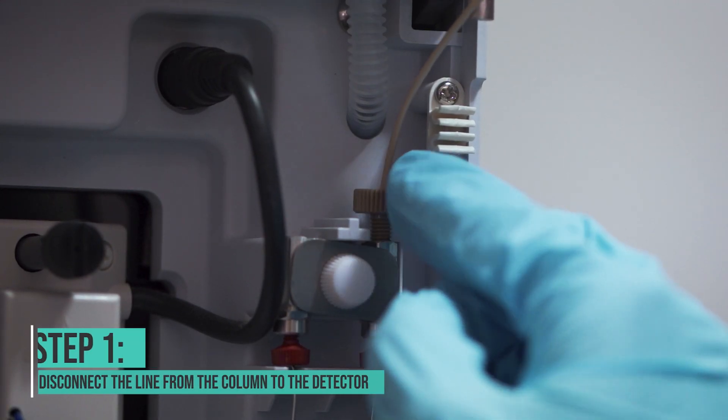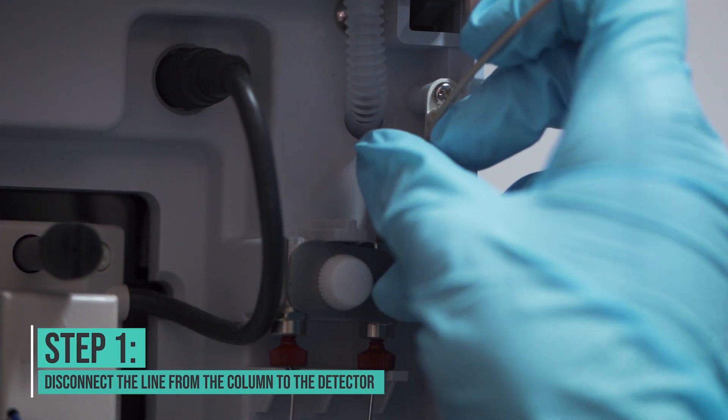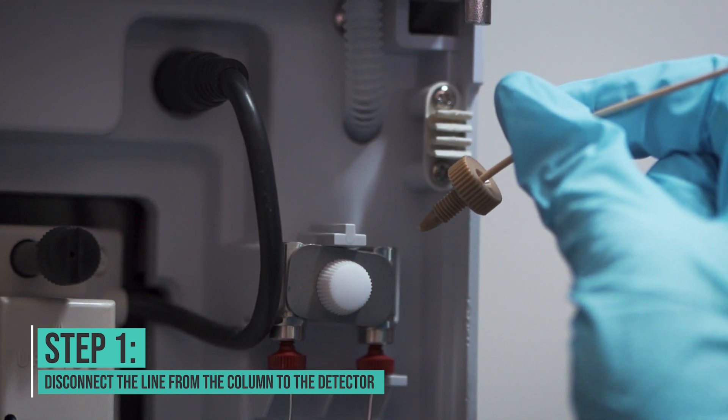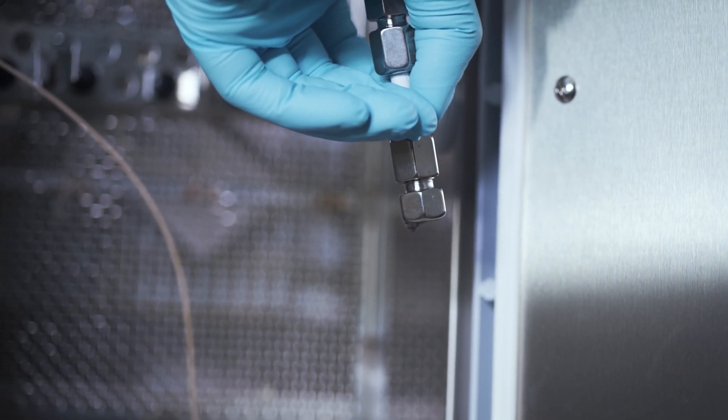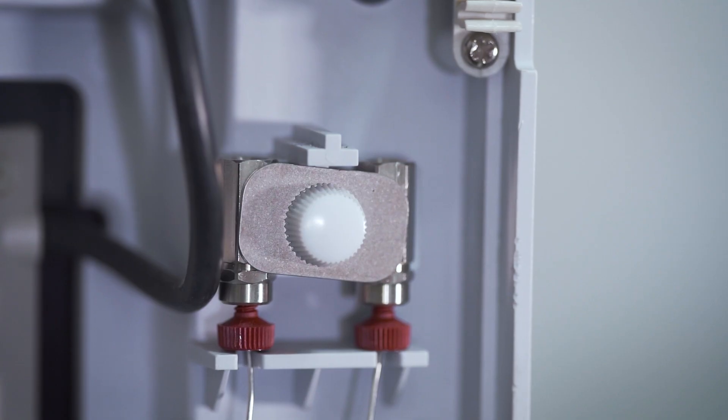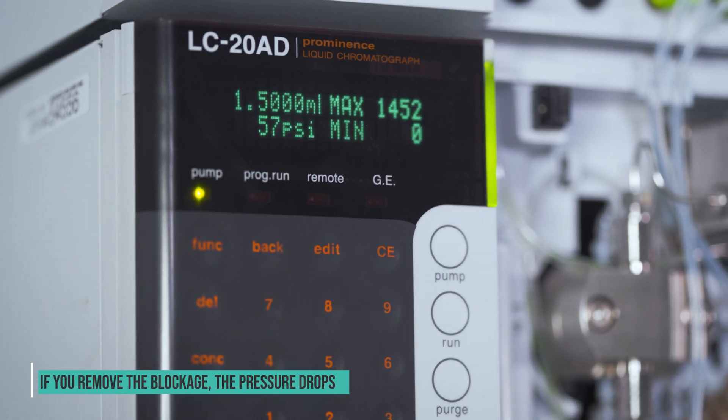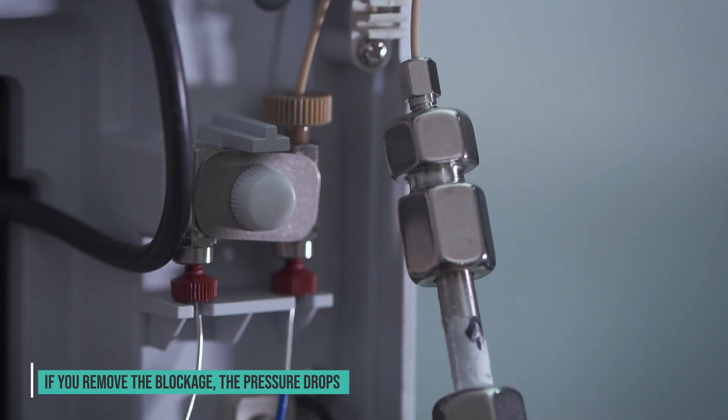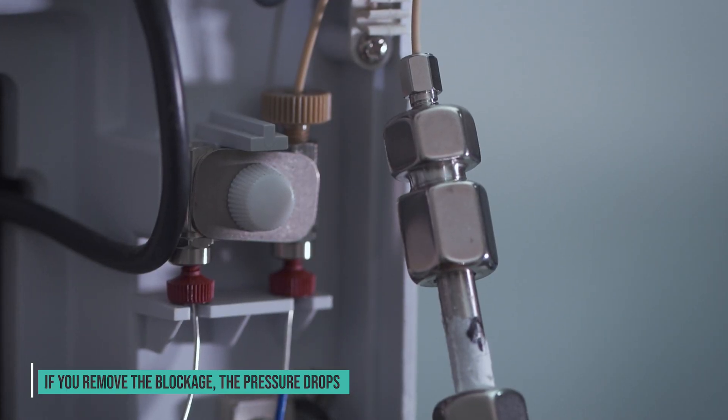The first thing you want to do is disconnect the line going from the column to the detector. If you leak the mobile phase coming out of the column into a beaker rather than the detector and the pressure goes down, then you probably have a clog in the flow cell or something inside the detector.